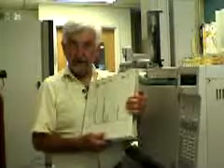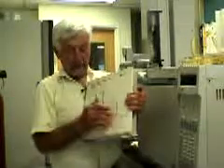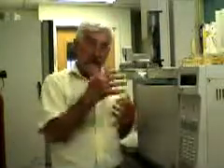Now our method measures 101 different PCB congeners. Occasionally we have two that come off at exactly the same time, so we have to report them as a pair. But our method also gives us information about three pesticides: DDE, which is the major metabolite of DDT, Mirex, and hexachlorobenzene. Now the methods can be used for other pesticides as well, but the method that we have set up for PCB analysis will give us those three.